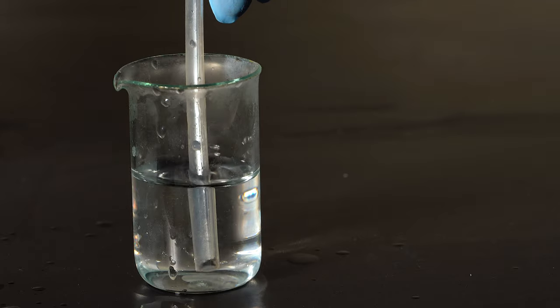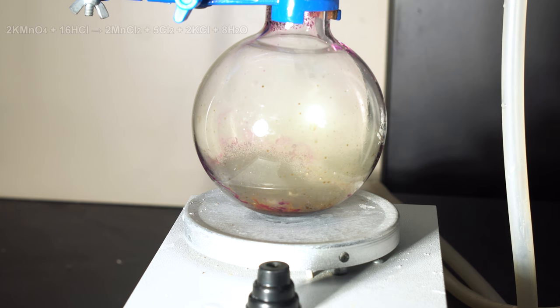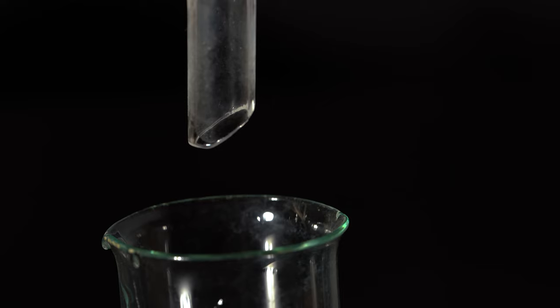The second required element for the reaction is chlorine. It doesn't matter whether it'll be dry or wet in this case. I will get it in a classic way, performing the reaction of potassium permanganate with hydrochloric acid.